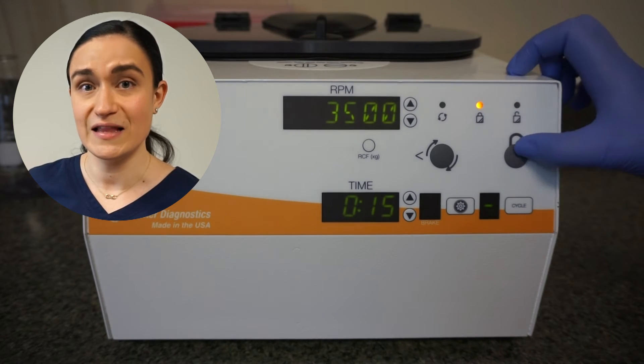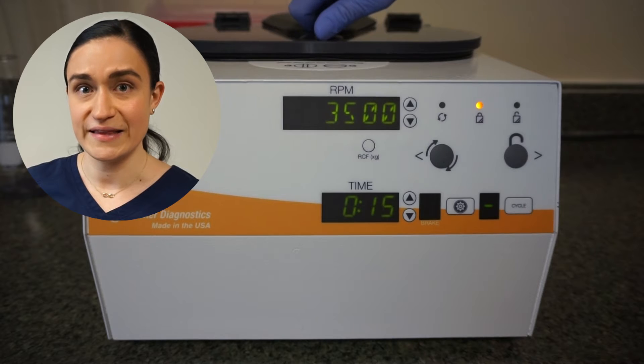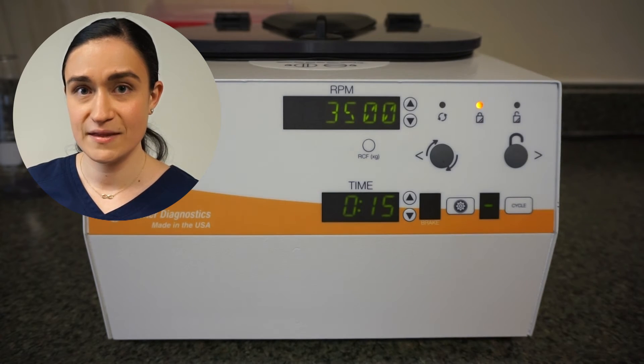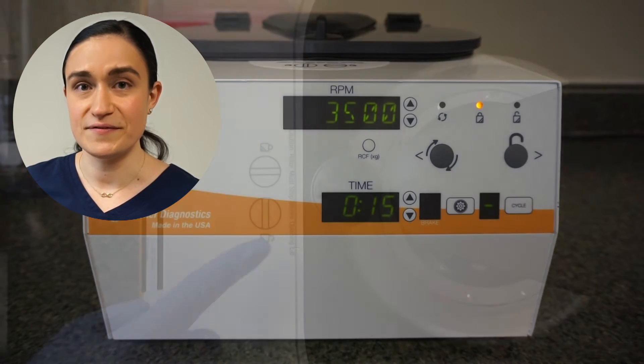If pressing stop unlock doesn't work, it's time for the emergency lid latch open system. To start, locate the open close label on the top of the centrifuge, just in front of the rotor chamber.